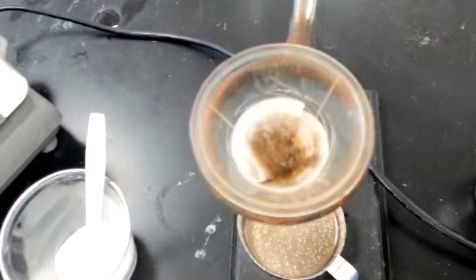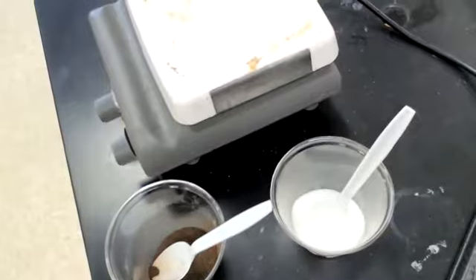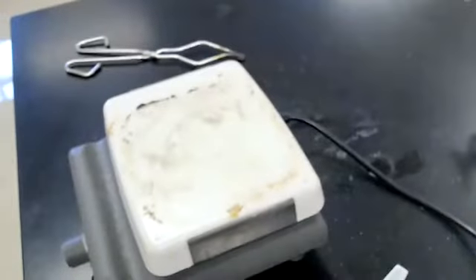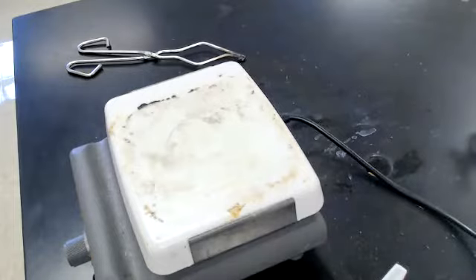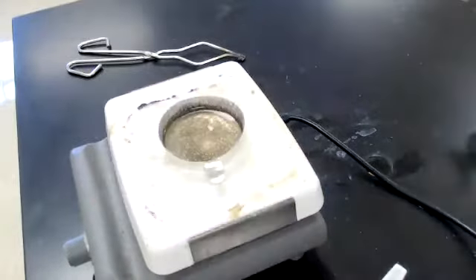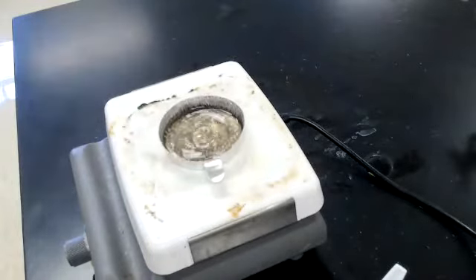So now we're going to put this on a hot plate. So I'm going to get you over here to the hot plate. So there's my hot plate. I'm going to carefully put my evaporating dish on an incredibly hot, super hot plate. Go figure, a hot plate that's on is hot.